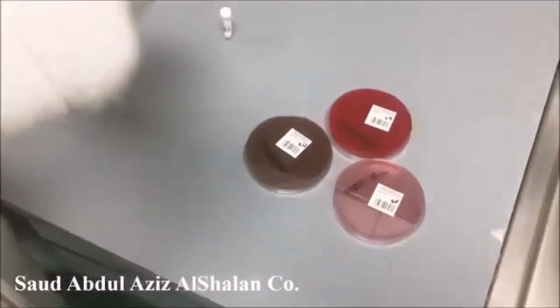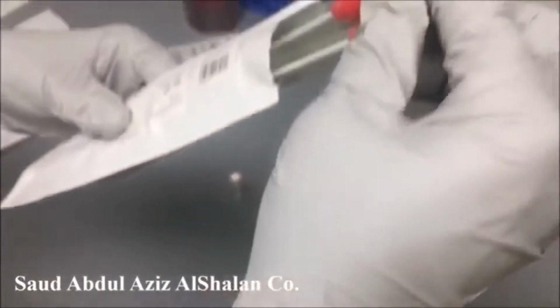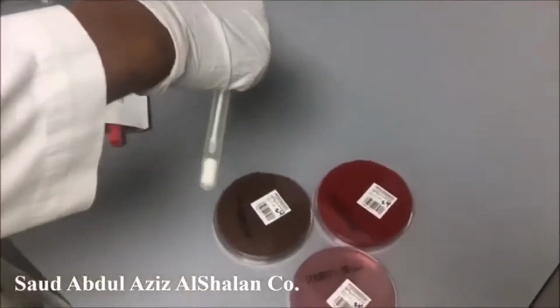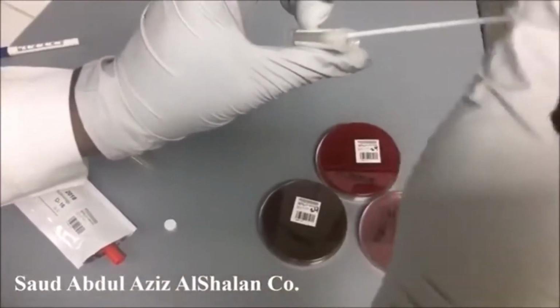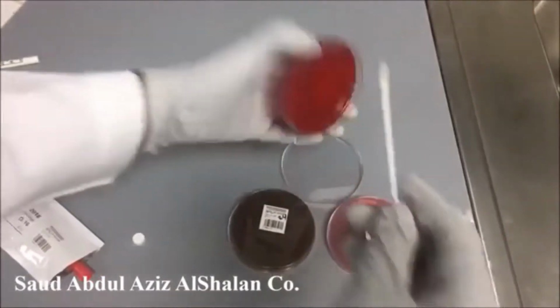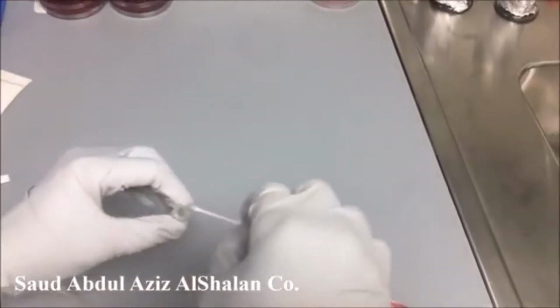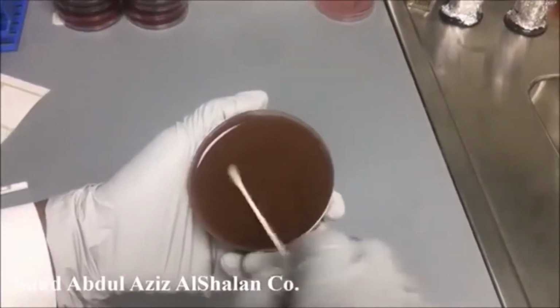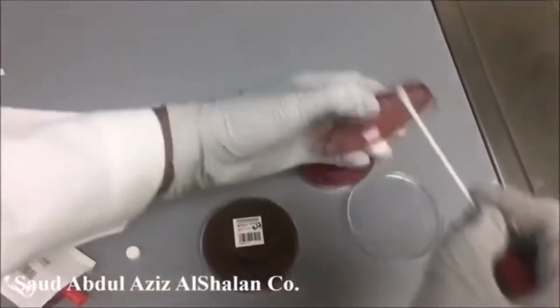Again, the specimen contains 2 swabs. We will use one of them, and this is the diluent. As we did in the first step, we continue the same procedure: blood agar, chocolate, and MacConkey.